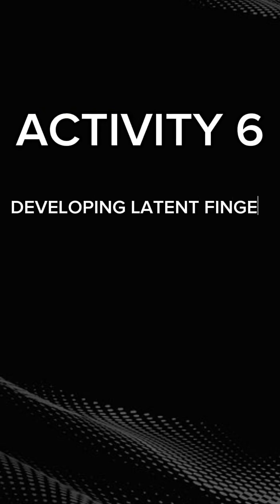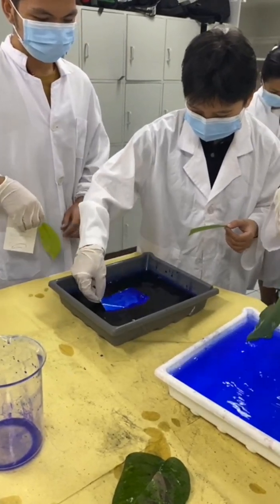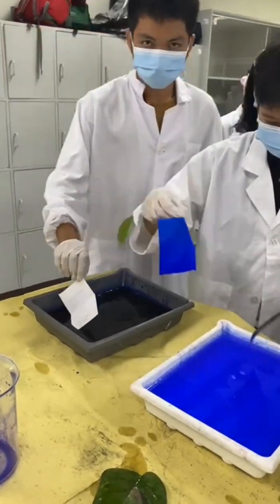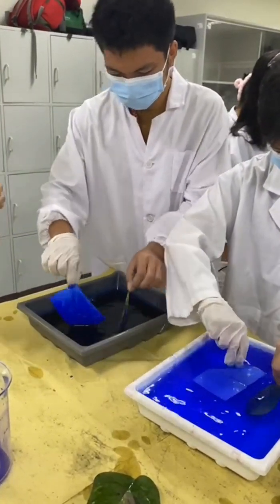Activity 6. Developing latent finger impression, Victoria Blue method. First, a non-porous object is prepared for processing. The surface is handled carefully to avoid introducing new prints. The item is immersed in or carefully swabbed with the Victoria Blue dye solution.